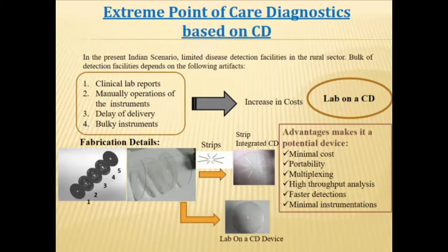making a CD platform. So this is extreme point-of-care diagnostics based on CD. CD is a compact disc. It is now going to be obsolete, but we are trying to keep it alive for biomedical applications. The clinical lab reports and all these things are actually increasing the cost of the diagnosis. So we would like to make a CD platform where you can make microfluidic channels on this CD so that you can reduce the cost, because the fabrication of that CD is not so high. As well, it will be very portable. It is a small system.